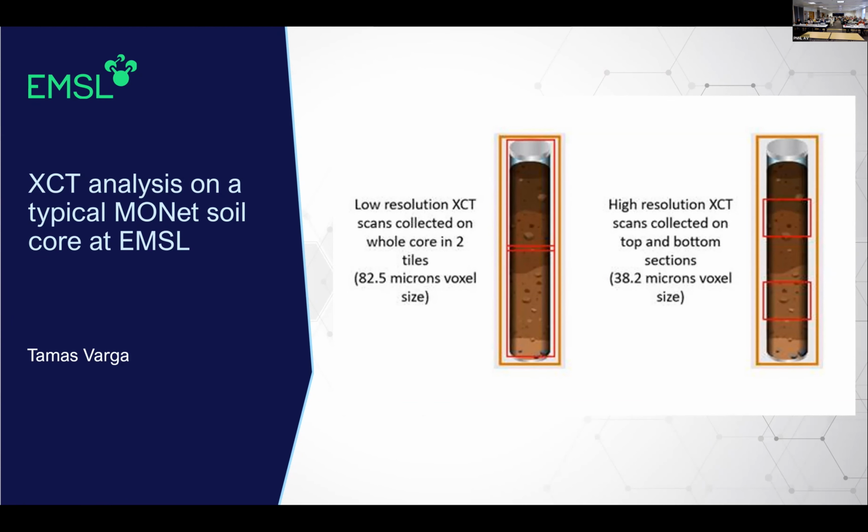Yes. I'm curious how long it takes to measure each soil core here for micro CT. Well, we opted for settings where the low resolution scans are done in I think 1.5 hours each, and then those 2 scans we spend 2.5 hours on. So it's 8 hours of scanning per core right now, and it can be programmed as a batch. You put in the core, and then you run. You can even stack 2 on top of each other if they are nicely packed.